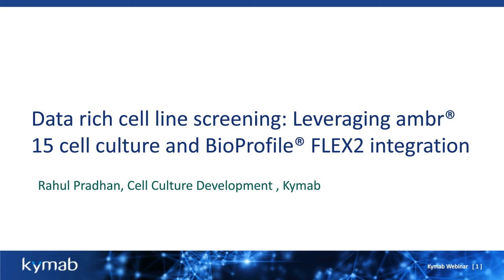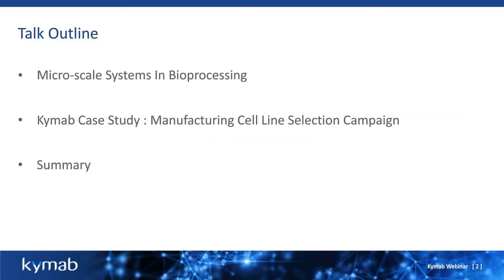Thanks very much for the introduction, Royston. So today I'll be talking about data-rich cell line screening by leveraging the integration between the ambr and BioProfile FLEX2. I'll start off by briefly talking about microscale systems in bioprocessing. Then I'll dive into the Kymab case study covering a manufacturing cell line selection campaign, and then conclude with a summary.